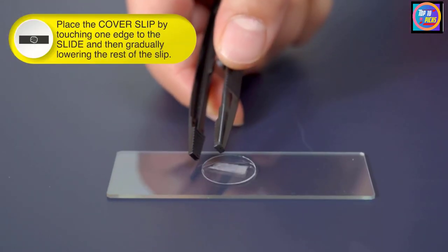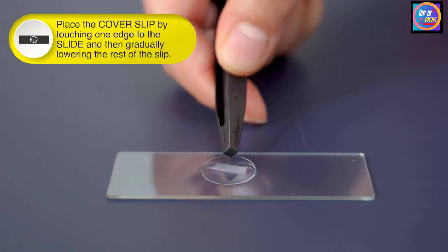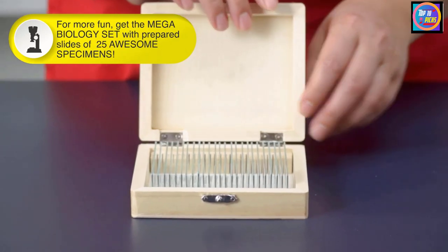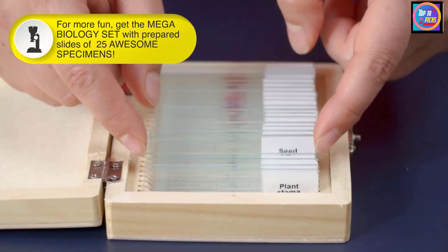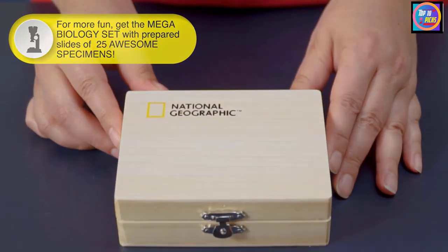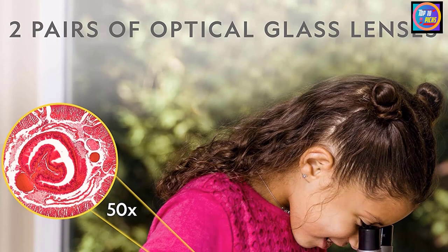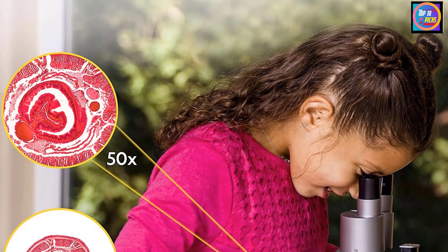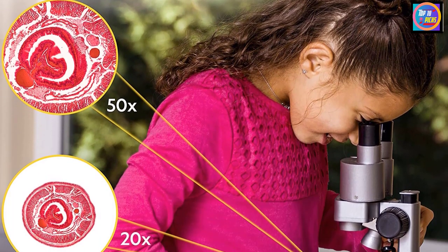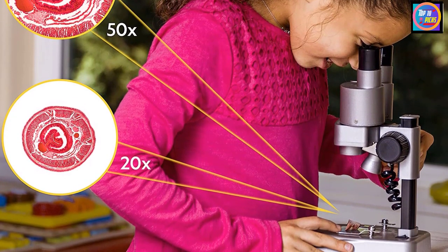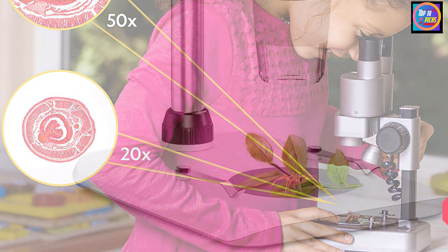This kit includes two sets of optical glass lenses providing 20x and 50x magnification, 10 prepared slides with a range of biological specimens, slide storage box, 10 blank slides, 10 slide covers, 10 slide labels, brine shrimp eggs and hatchery station, tweezers, and an eyedropper for slide prep, petri dish for plant labs, a mini geode, and a microscope's learning guide with full operating instructions.